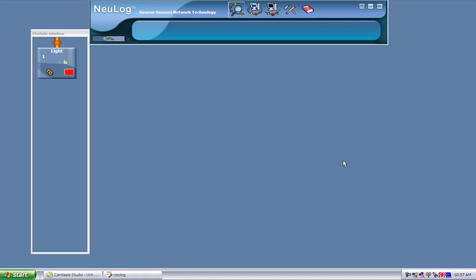Hi, this is Alan from Training Systems New Zealand with the second in our series of videos introducing you to the Neulog range of sensor data loggers. I've got the Neulog software in front of me. I'm setting it up to recognize a light sensor.